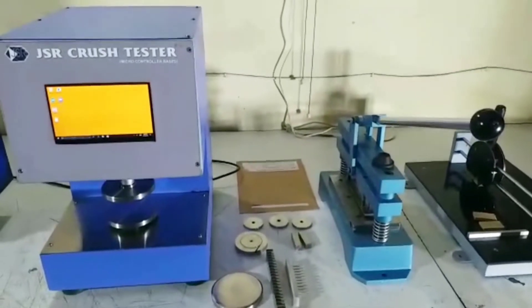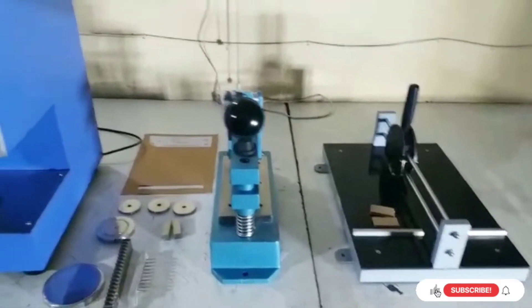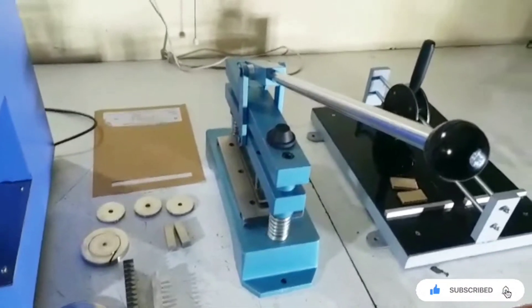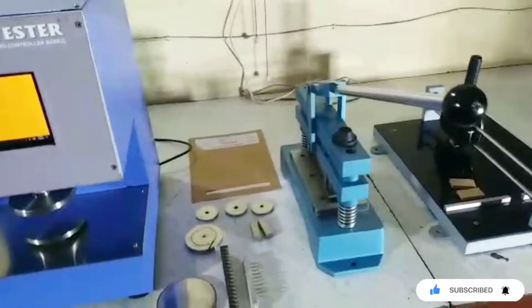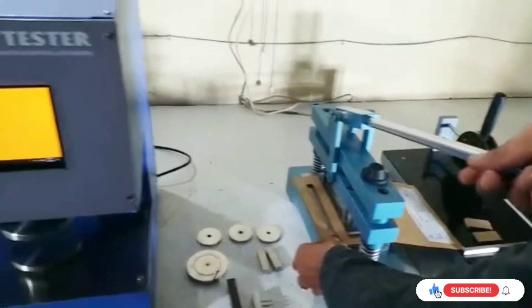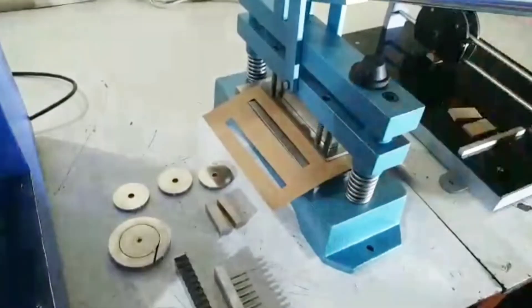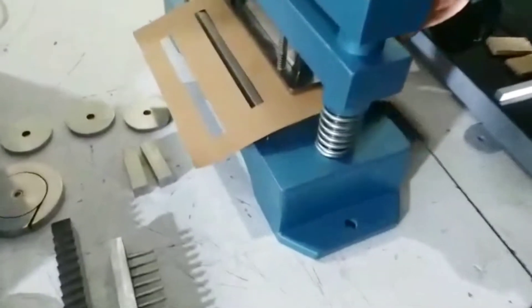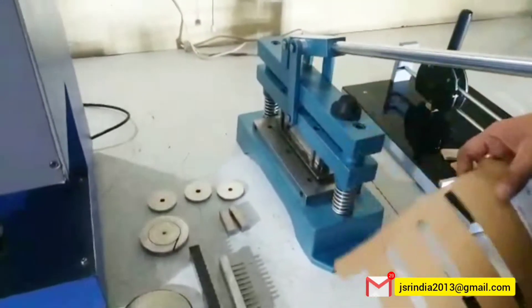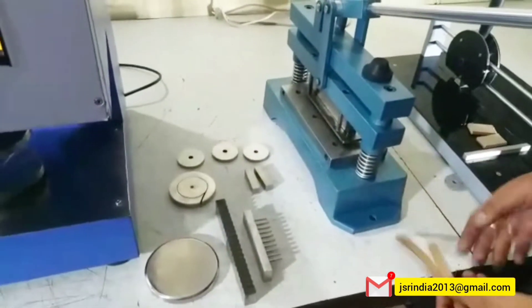JSR crush tester. These are two cutters used for different sampling purposes. One is for ring crush. This is a die and punch cutter by which we cut the sample size of half inch by six inch. So we can use this paper, this craft. This cutter has two holes which you can use for grouting purposes. These samples we can use for taking the result.